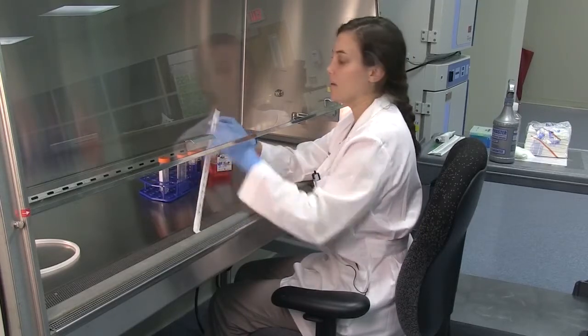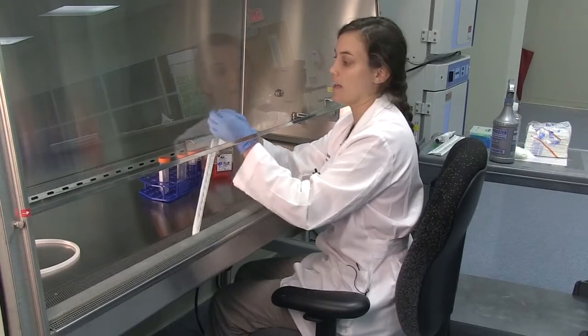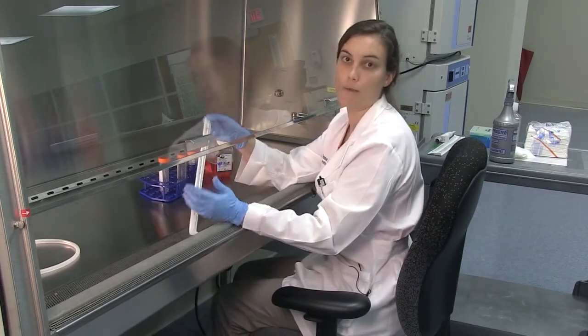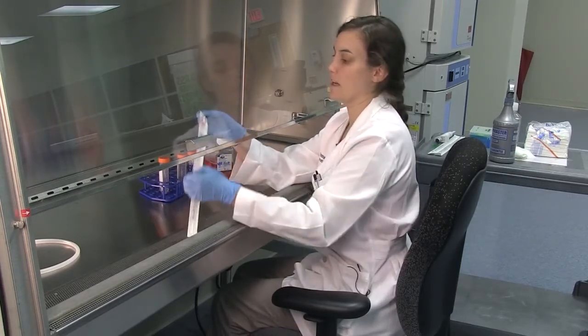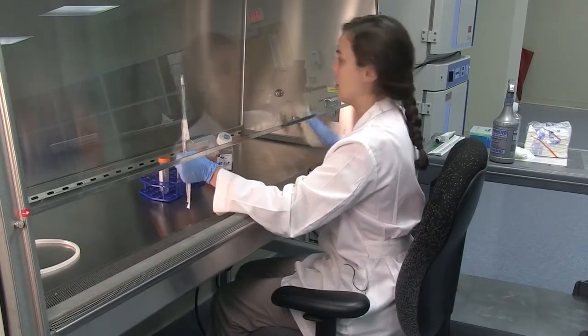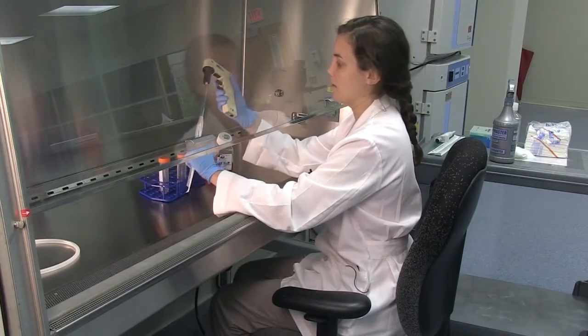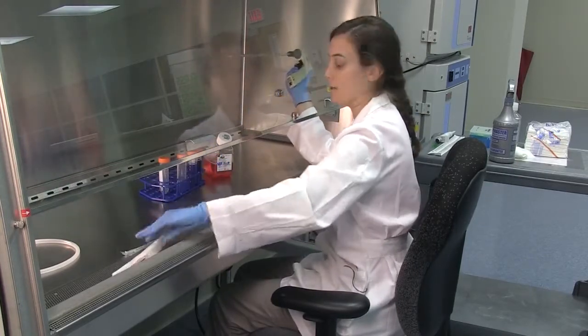When opening the pipette, make sure you're not touching anything with your hands. Everything inside the package is clean and you want to maintain that, so open it carefully without touching the pipette. Then attach your pipettor and discard the wrapper.